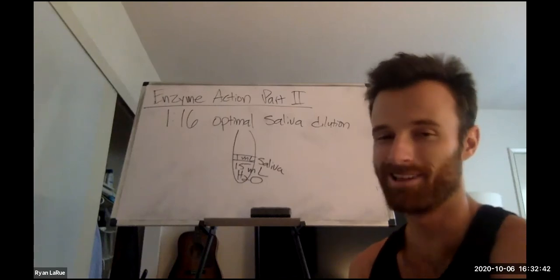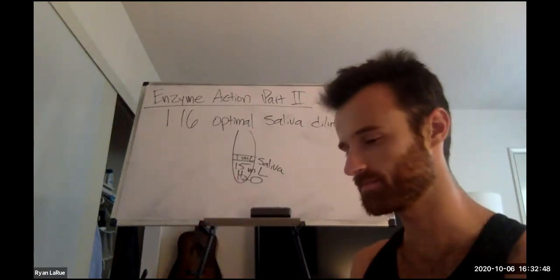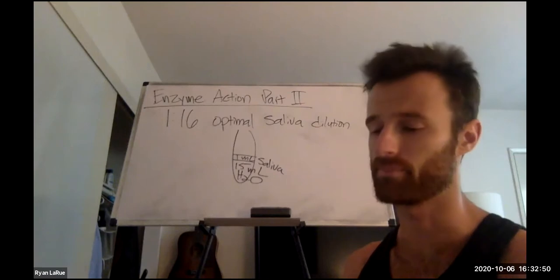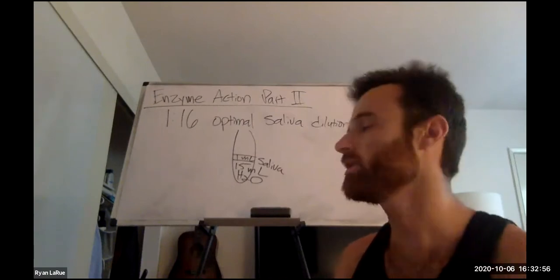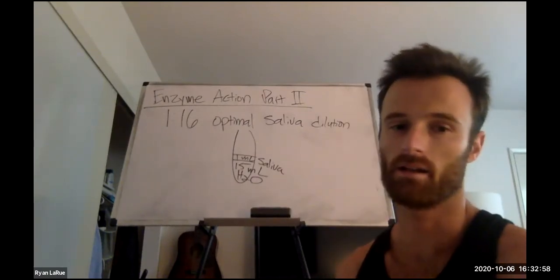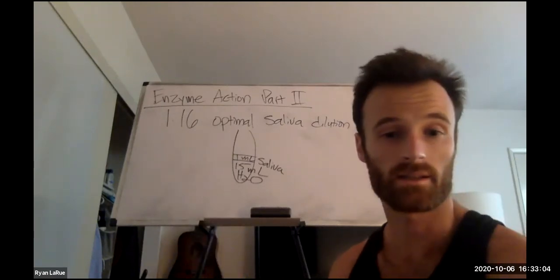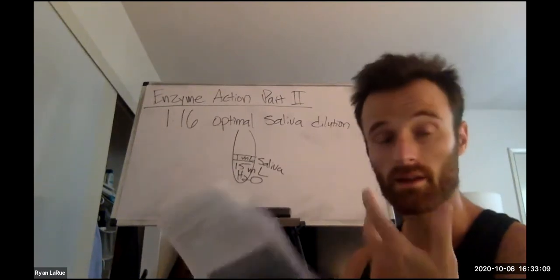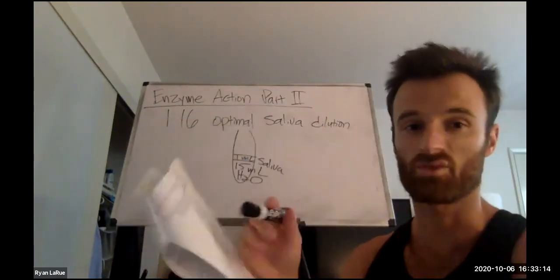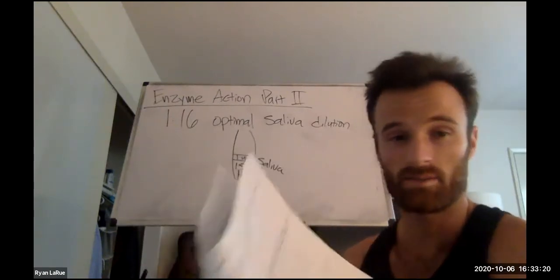So you can come up with one. Based on what environmental factor you choose, let's say you choose NaCl, your hypothesis could be, for example, increasing the concentration of NaCl will result in a decreased level of enzyme activity. And then for that hypothesis, you look at the data that Stacy collected for NaCl and just write for that question, "the data support my hypothesis."